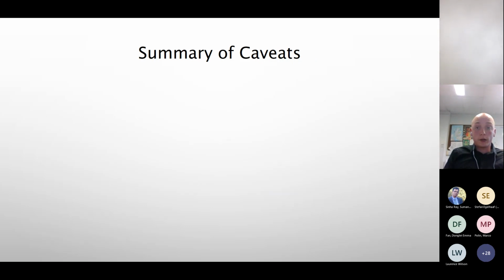I am also aware that we're all scientists and we know that every tool has limitations. Nothing is perfect. So in addition to the things I said were required for the system to work at all, you also need to deal with some of the limitations. First off, it's not yet a widely known technique, so you typically have to explain it to people before you use it. With things like this talk, I'm not sure if the entire audience will know what DDM is. Some of you I know have heard me talk about it before. Typically, you need to explain it a bit.